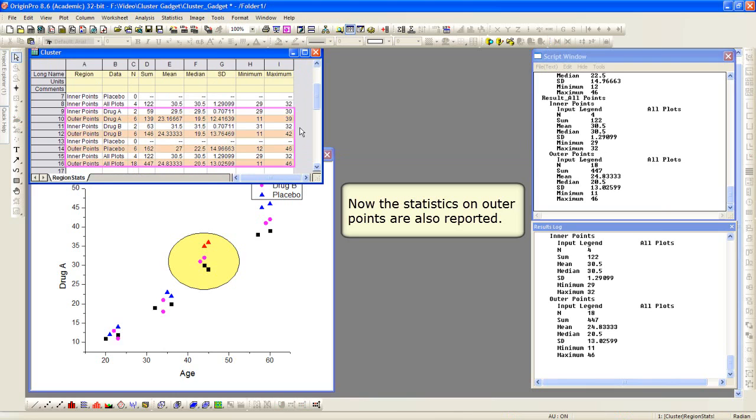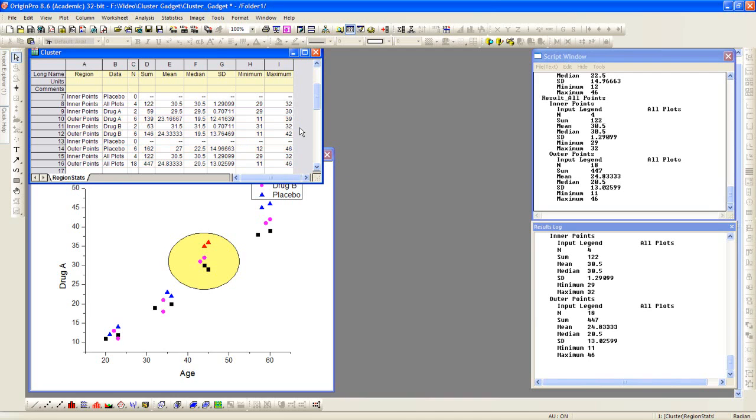So the first time you output results, it generates that book, and then it will continue to append to that workbook. So you see for inner and outer points for drug A, drug B, and placebo, we have the statistics.